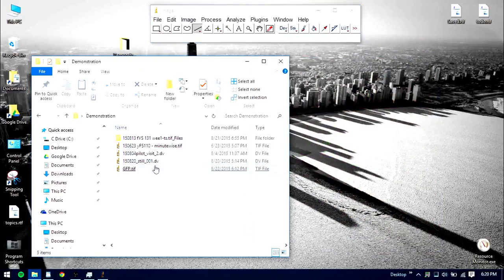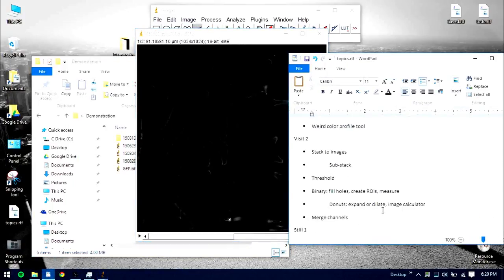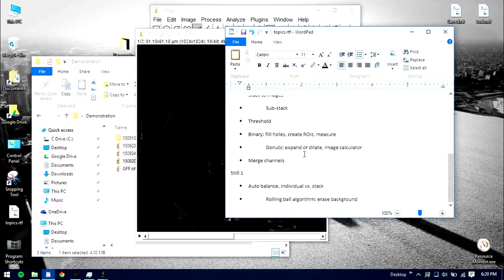And now the last thing that I'm going to get to is this, still 001. And there are a couple of things that we can cover over here. I didn't cover donuts in the previous one, so I'm going to move that bullet over here.